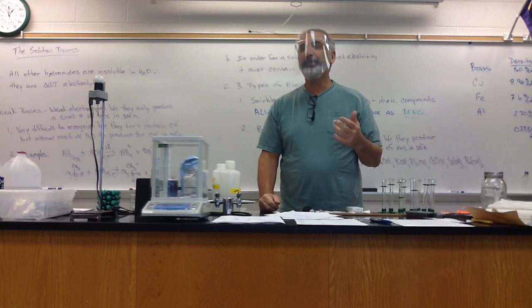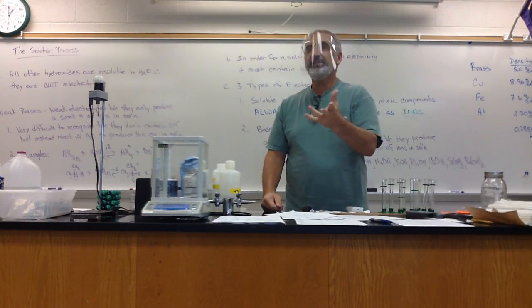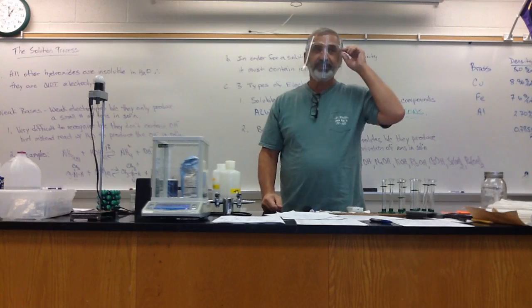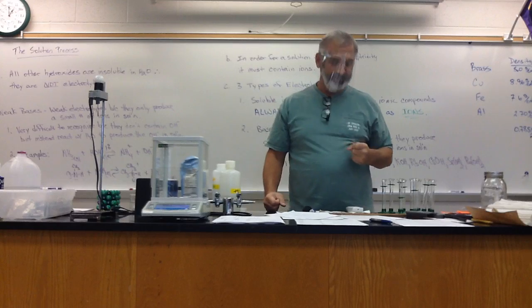Okay, you have 4 metals. The first hypothesis that you need to fill out. Can we touch them? Yeah, you can. That's why everybody's got their own individual. You're actually going to have to spray them down and wipe them at the end.